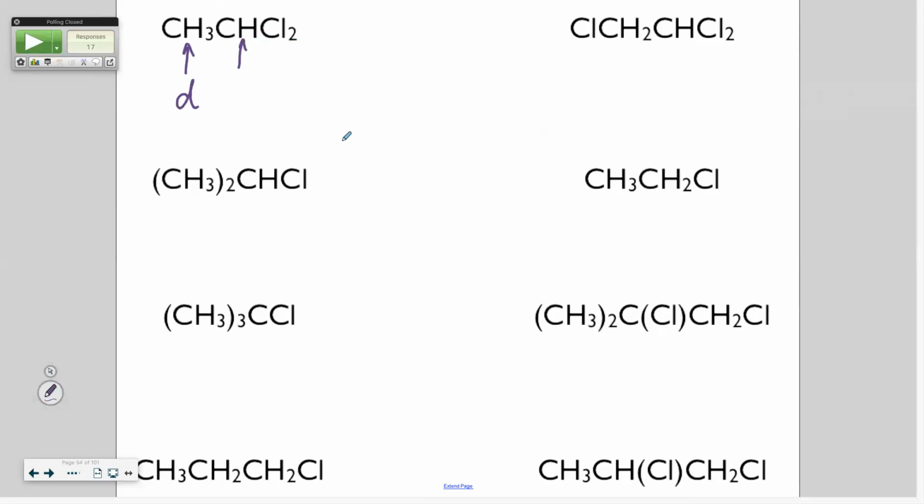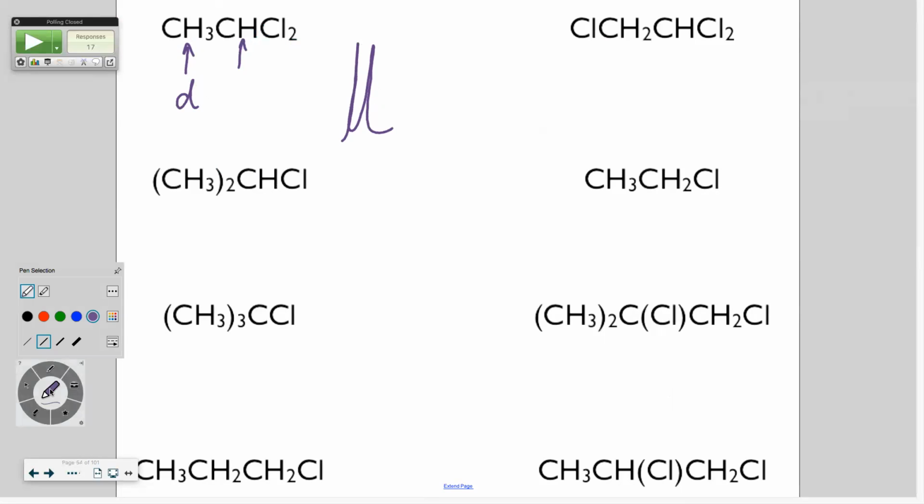A doublet will look like this. They will be about the same size. How tall they are depends on how you ran your spectra and how many hydrogens are making up that peak in the spectrum, which will be 3. You get that from the integration. I'll ask you some more questions as we go to help you.